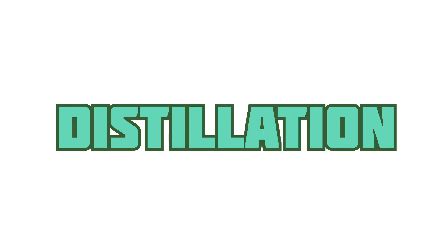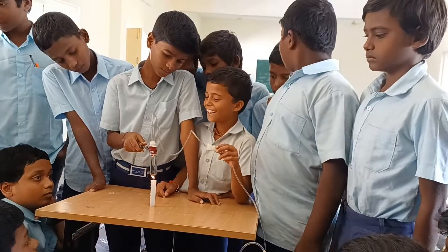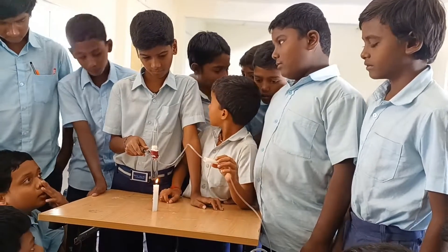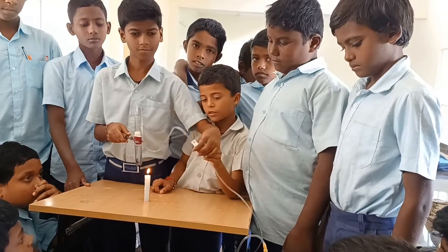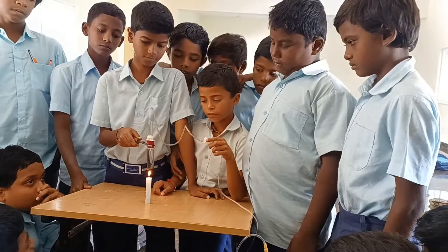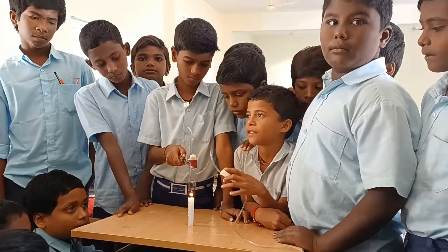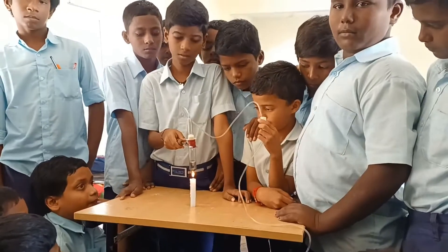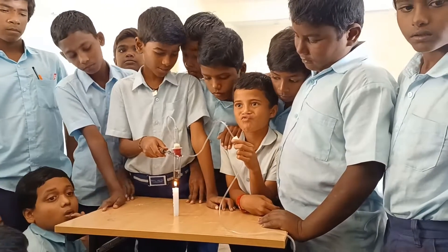In this video, our children are going to perform an activity on distillation. In this activity, they are trying to prepare distilled water. This distilled water is generally used by doctors to mix with injection powders. They are trying to get distilled water from normal water.